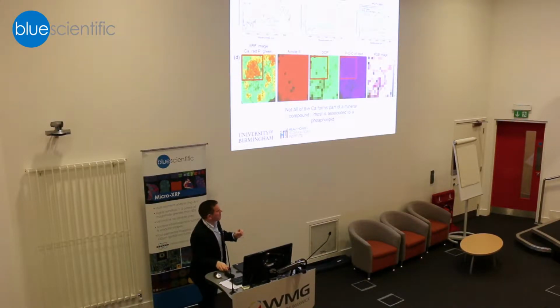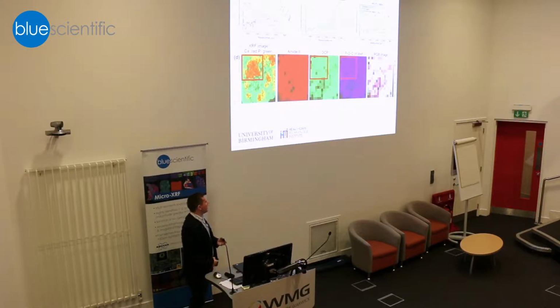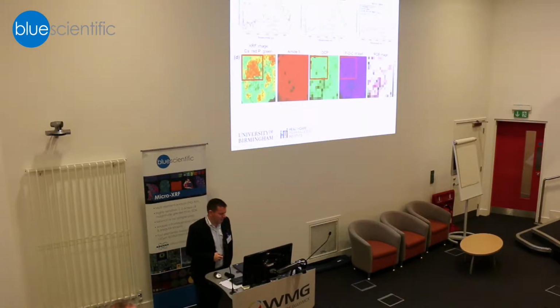That was key for us because that explains why your cells and your tissues don't mineralize on their own automatically. So it's kind of like a safety mechanism. And we wouldn't have found that had we not been able to differentiate localization of elements and compounds overall in these samples.